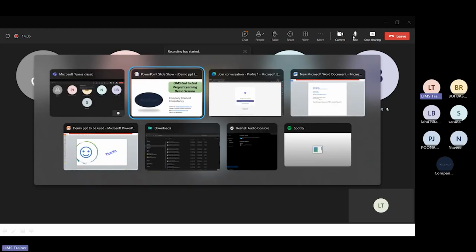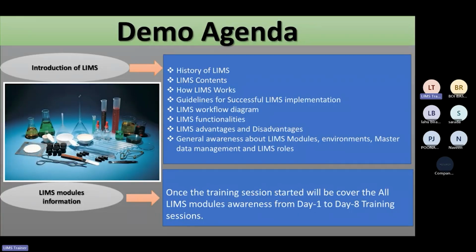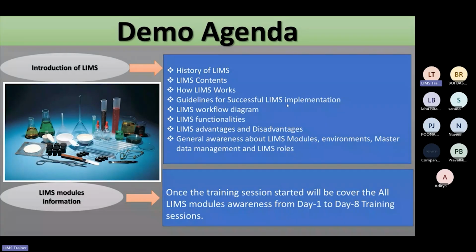So let me share my screen first. Any questions that come to your mind while we go through this demo, you can ask me. The first thing in this demo: I will explain what LIMS is, the history of LIMS software, then the different contents of LIMS, then how laboratory information management works. Then the guidelines for successful LIMS implementation. See, why is LIMS implementation important?